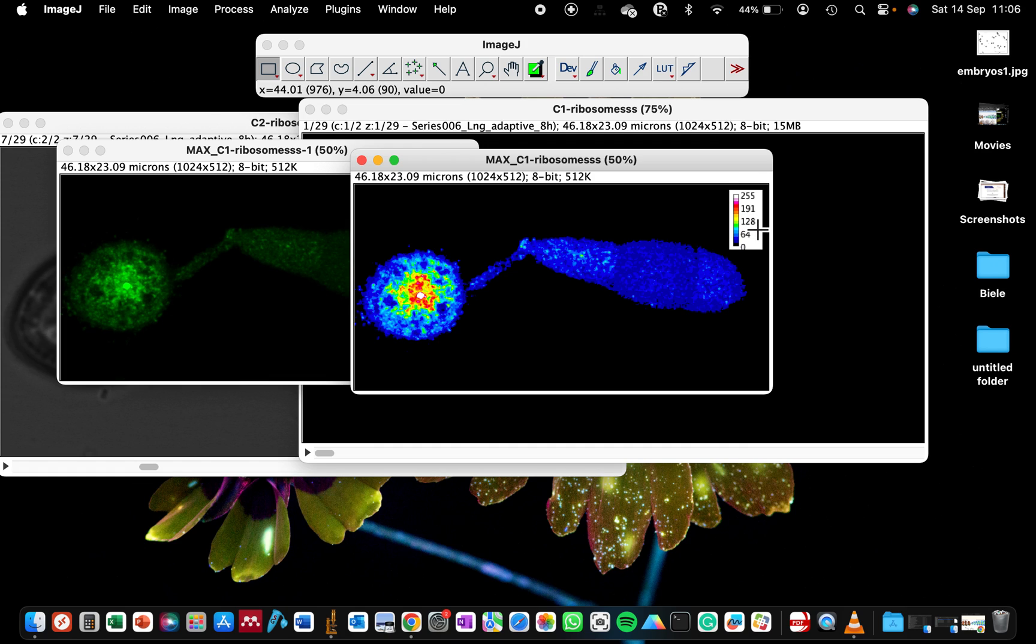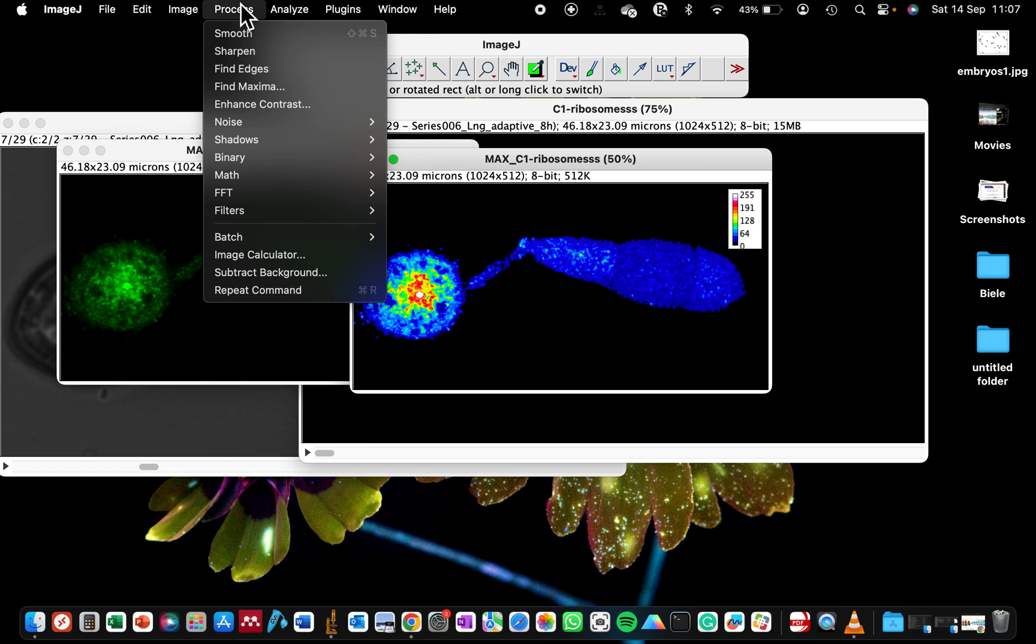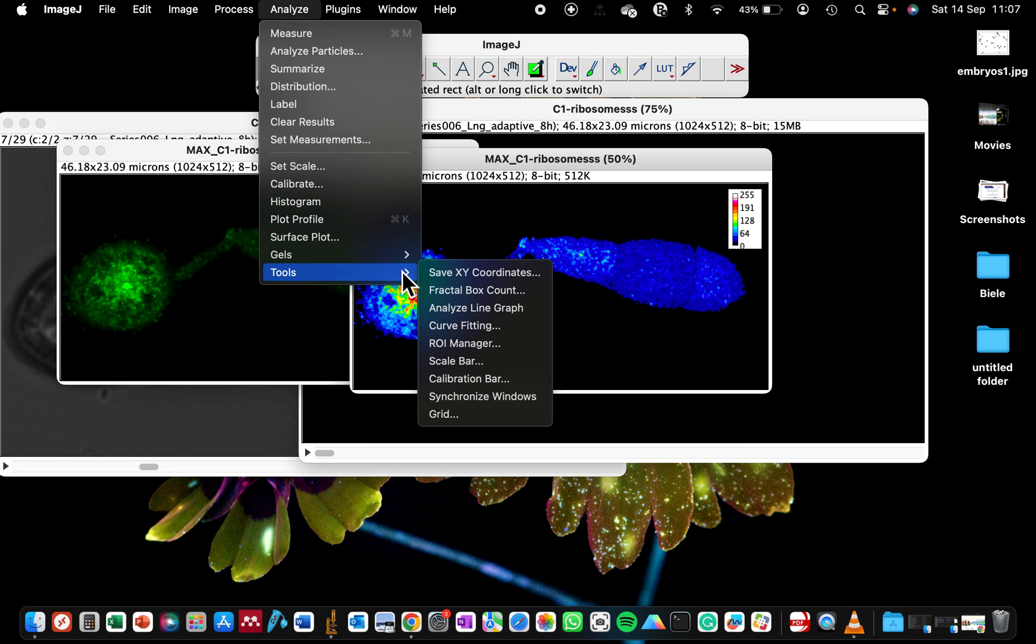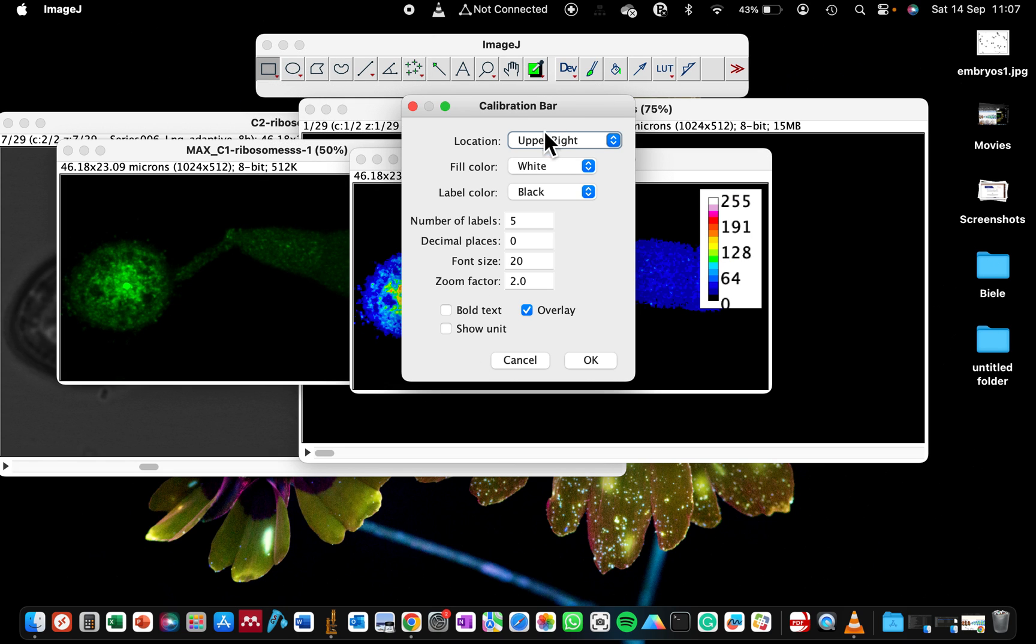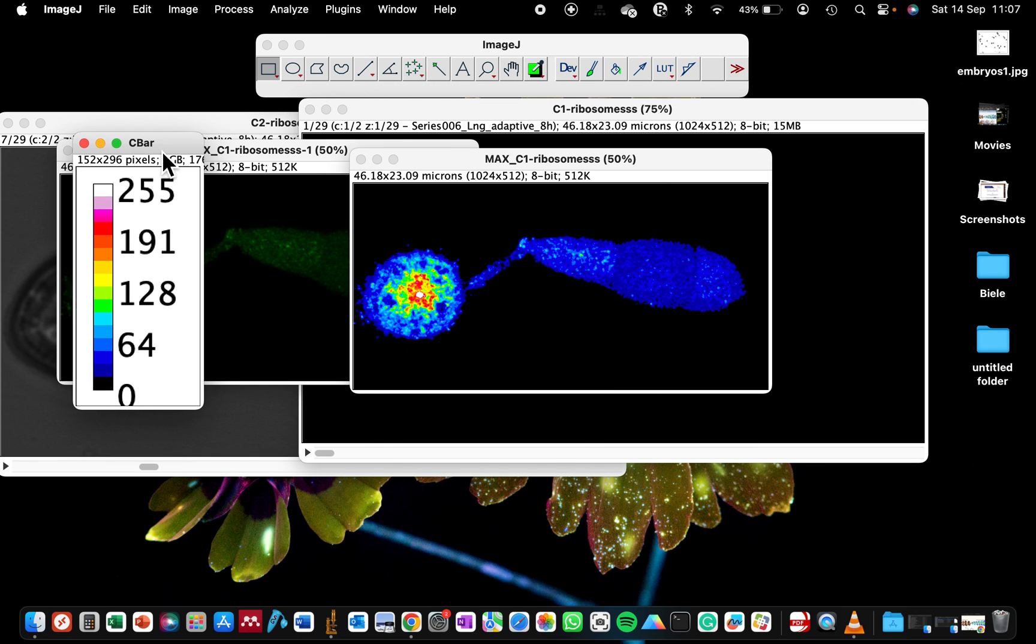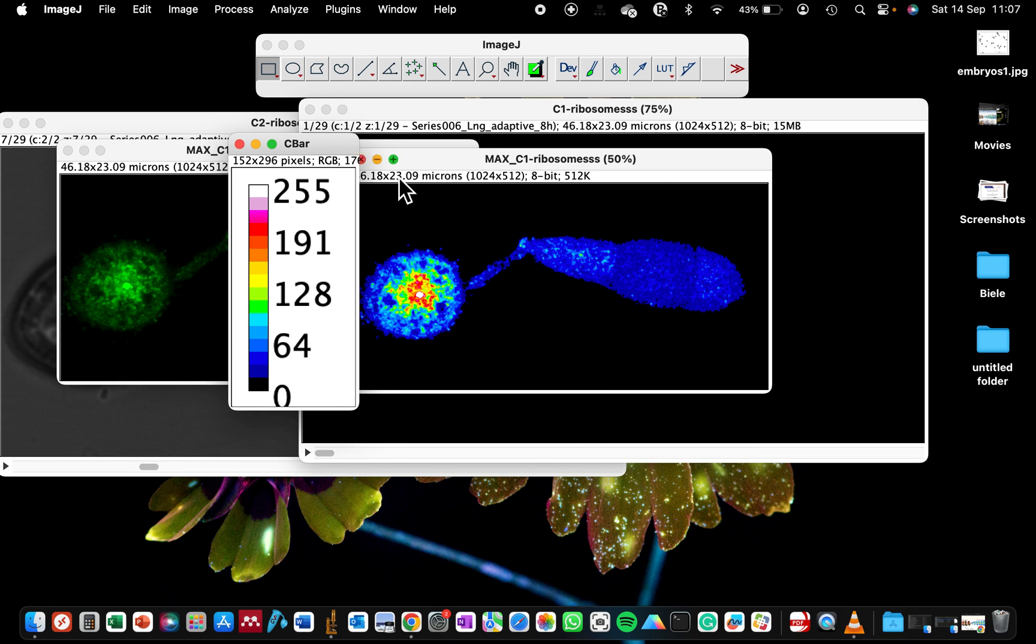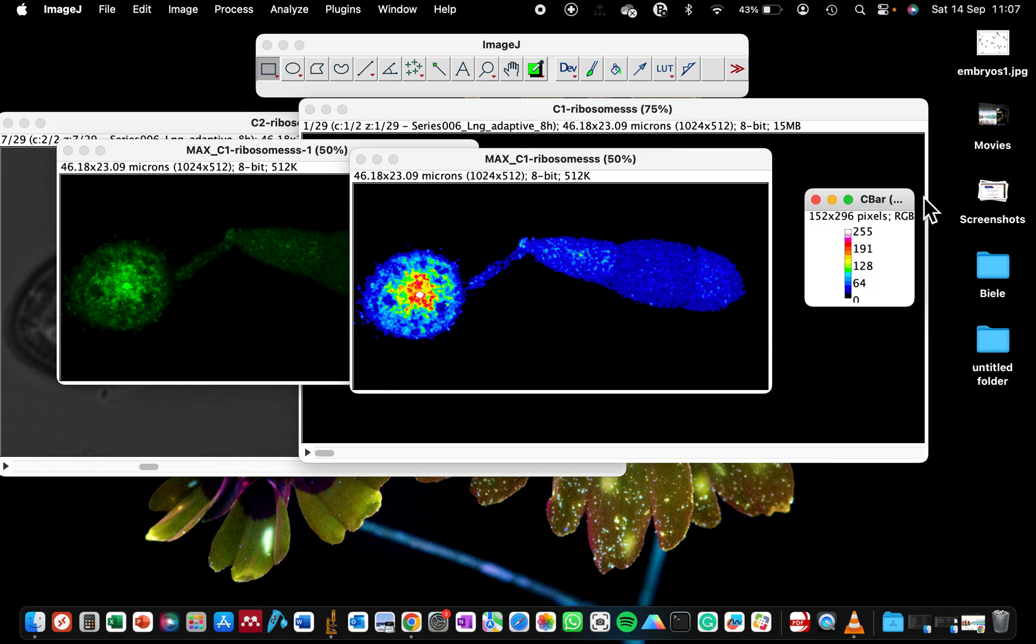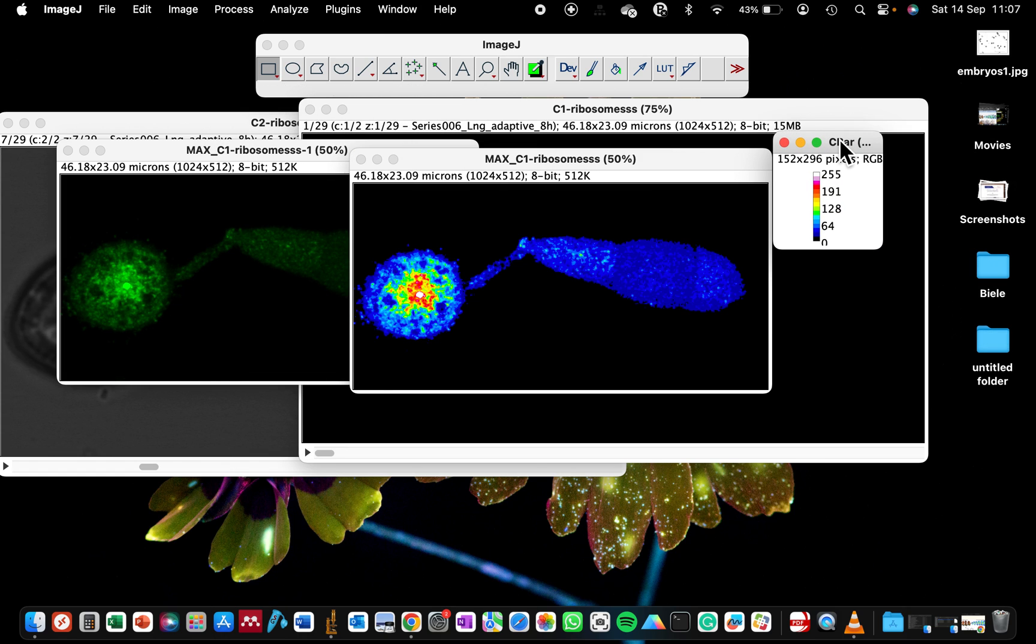You can also decide if you want your calibration bar to be outside of the image. If you are displaying multiple images, you don't want each image to be repeating the scale bar, especially if they were all captured with the same settings. We can repeat that process by going to Analyze, Tools, and select Calibration Bar again. Tell it that we want to make a separate scale bar. That way our scale bar is no longer attached to the image and you can decide where you want to place it in your figure or presentation.